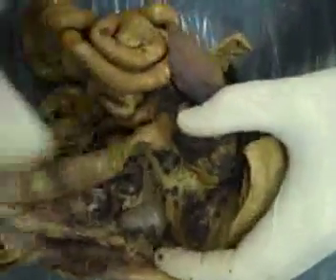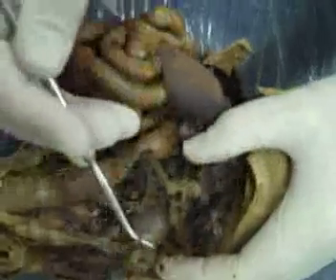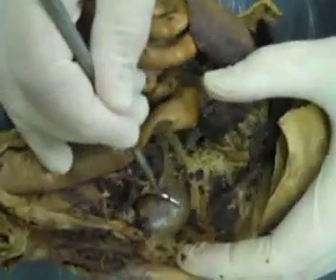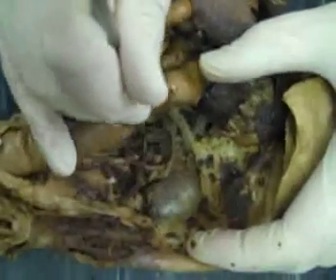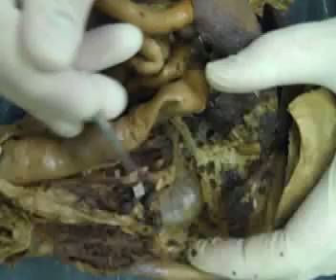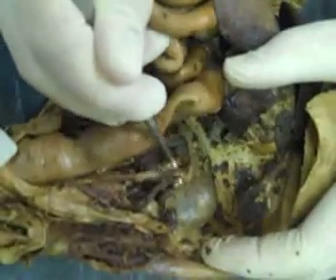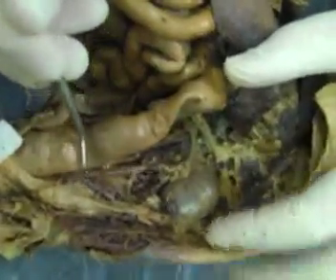Let's start with the urinary system. So here's the kidney, and I usually like to do the left kidney. It's easier to get at it. The kidney is attached to the bladder by means of the ureter. We should be able to follow the ureter all the way down from the medial side of the kidney all the way down to the bladder.